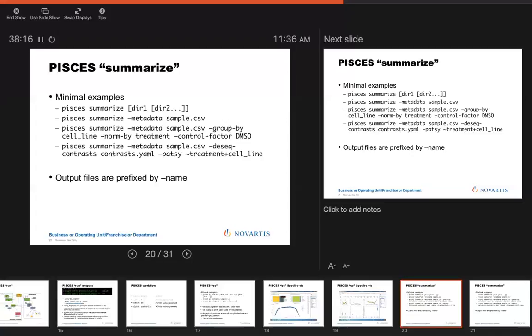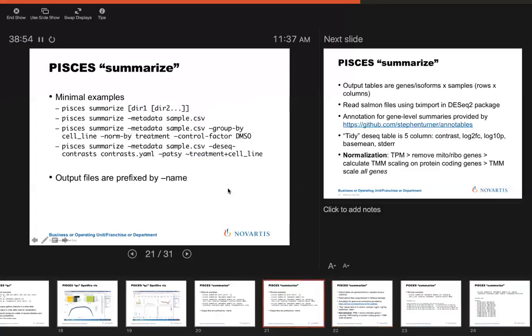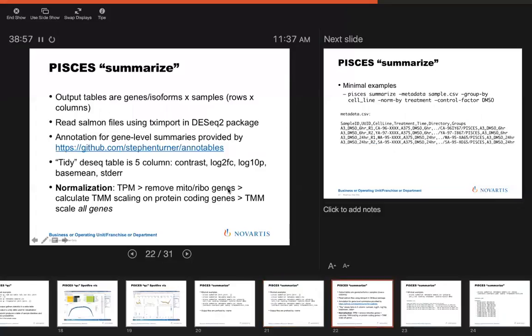And usually that's just doing differential expression between treatment and control groups. Because that's a huge use case, I define my contrasts for DESeq in a YAML file, and I pass in a Patsy formula that's logged, so this is all reproducible. For me, that's important because 5 months later, if somebody asks me to go back and look at what I did in their experiment, I have no idea. And this also allows other analysts in the group to go back and see, okay, well, this was the analysis. It's not just some R script that nobody documented, right? You actually have labels.